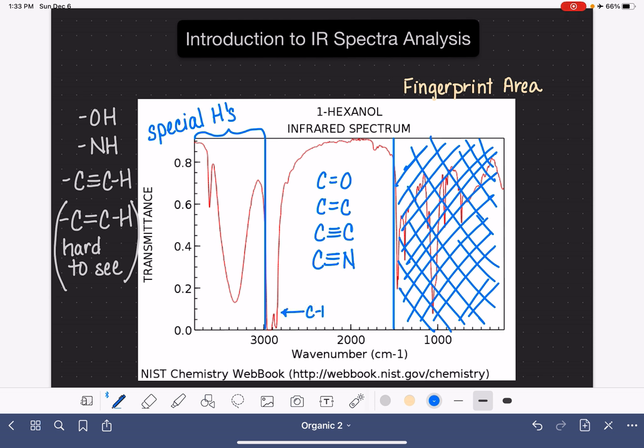Again, your carbon-hydrogen peaks are going to be right around the 3000 mark. They might be a little bit inside this area. Don't confuse them because, in this case, they're very strong. Don't confuse them with one of our important functional groups. All of these functional groups tend to show up more in the middle of this area, not really encroaching on either one of the ends right here.